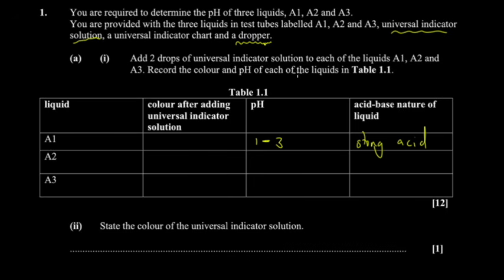One of the precautions is that the universal indicator solution can be temperature sensitive. It can be maybe 25 degrees Celsius. This is the standard ambient temperature. The expected normal labs are usually around this temperature. So you'll be able to do the experiment well in those optimum conditions.